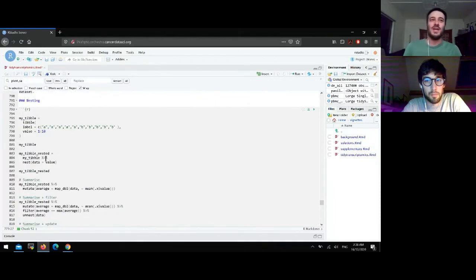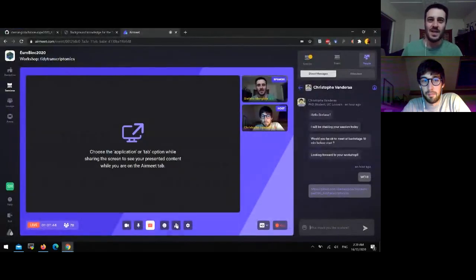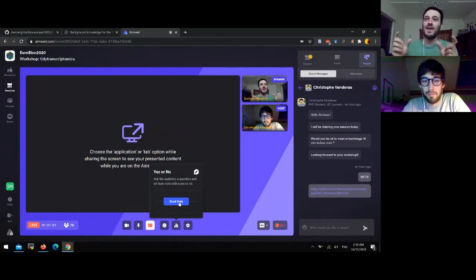Before we go to the next part, which is quality control, this part will use a powerful, probably I reckon the most powerful tool in R so far for functional programming, but not many people know about it. So I will actually launch a poll. How many of you have experience with the function pair nest and map? Nest is from tidyr, map is from purrr.